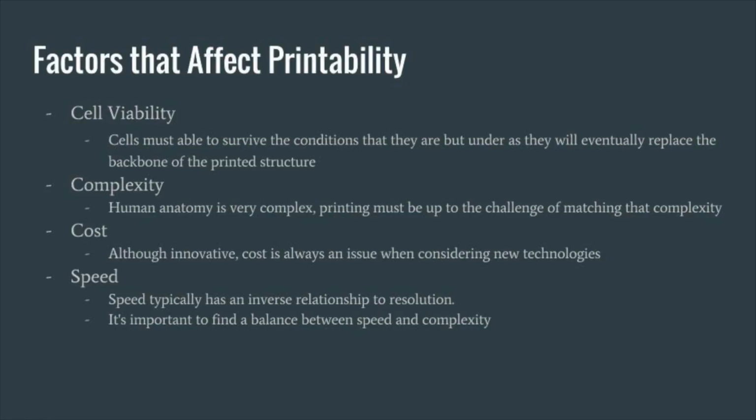The factors that affect printability are cell viability, complexity, cost, and speed. These are all important to consider when deciding which type of printing method you should use, as complexity and speed can often be inverses, while maintaining cost can often be an issue when printing something using bioinks.